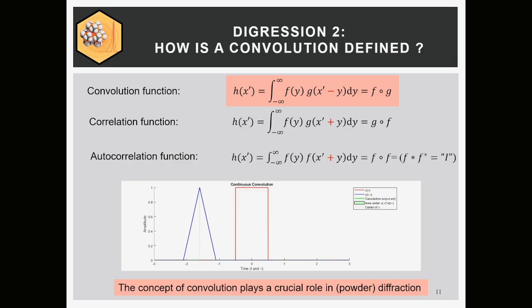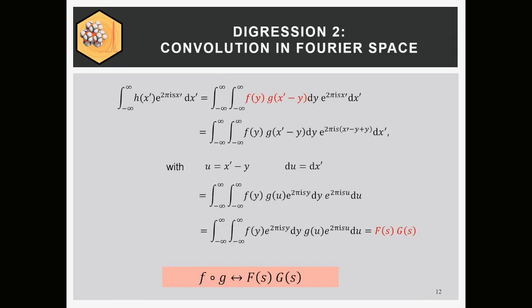But that means this is a very complex integral, and that's a big problem to do, yeah? I mean, solving such an integral is only possible numerically, because only in very few cases do you have the actual function and can actually calculate this. And therefore, convolution is much, much easier in Fourier space.